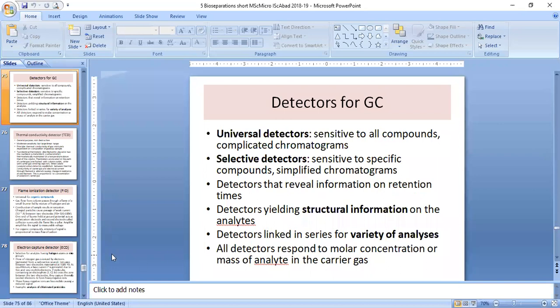In the gas chromatography, after we separate the different components, each component goes to the mass spectrometer, and the mass spectrometer will carry out the analysis to find out the identity of that particular compound. Is that clear? Or instead of a mass spectrometer, we can also attach an infrared spectrometer for that matter, or an NMR spectrometer. Is that clear to everybody?